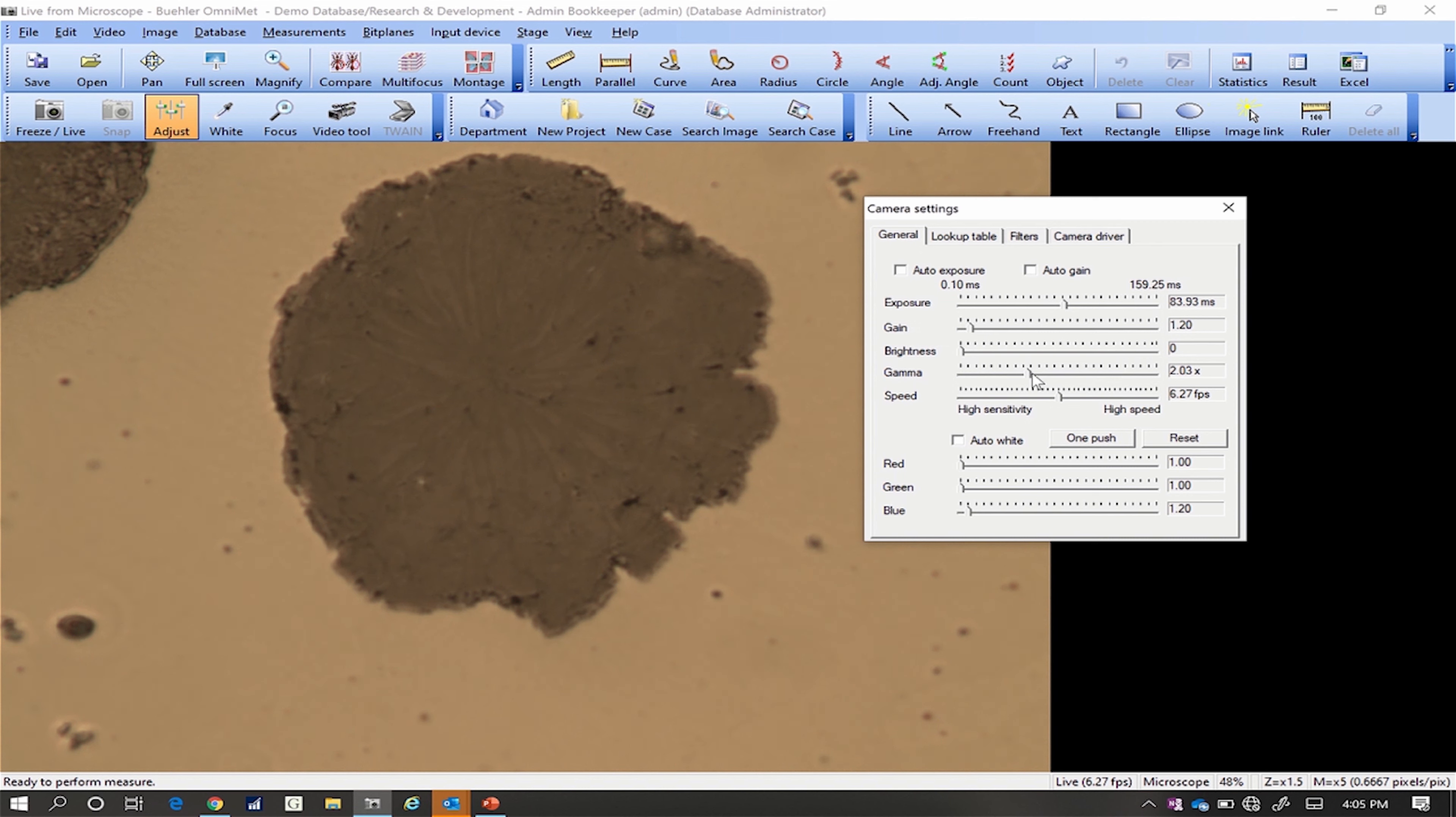Any color in the image should now be caused by your lighting system. We can use a white balance tool to correct for this.